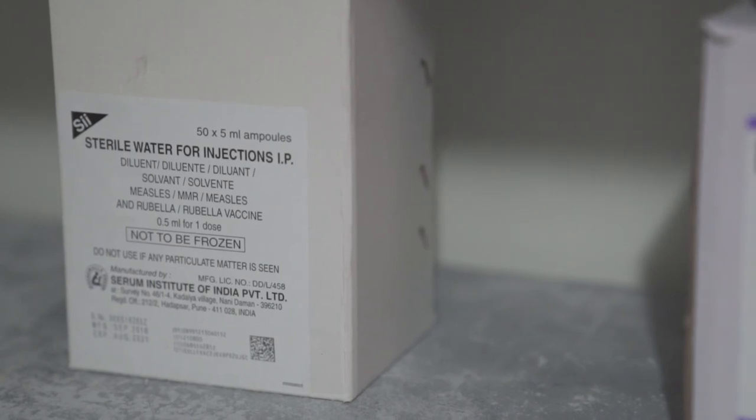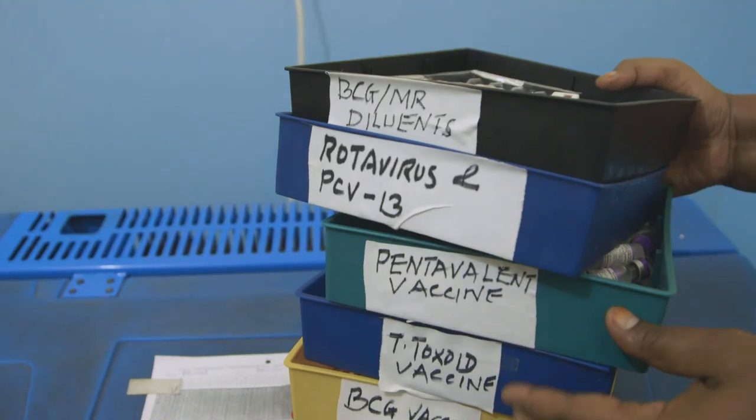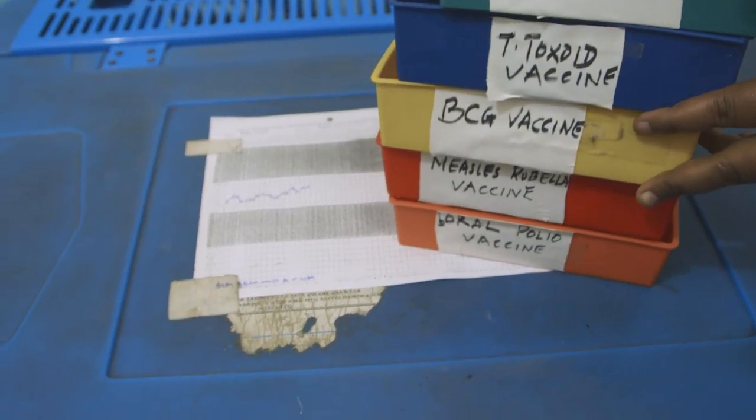You should now have a clear picture for how to use front-opening refrigerators. Remember, the temperature inside the compartment can vary, so it is important to arrange vaccines and diluents correctly to keep them safe and effective.